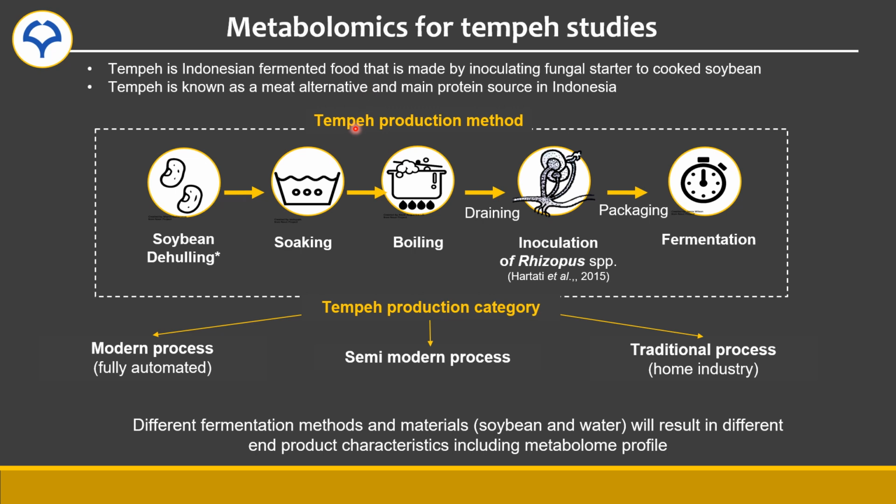The next study is metabolomics for tempeh. Tempeh is an Indonesian fermented food that is made by inoculating fungi with cooked soybeans. So, it is similar to Japanese natto, but tempeh has a solid texture. Throughout the world, tempeh is known as a meat alternative and is a very important source of protein in Indonesia. In Fukusaki Laboratory, we studied the differences between the tempeh production methods and analyzed the difference in the metabolome profiles of the cooked tempeh.